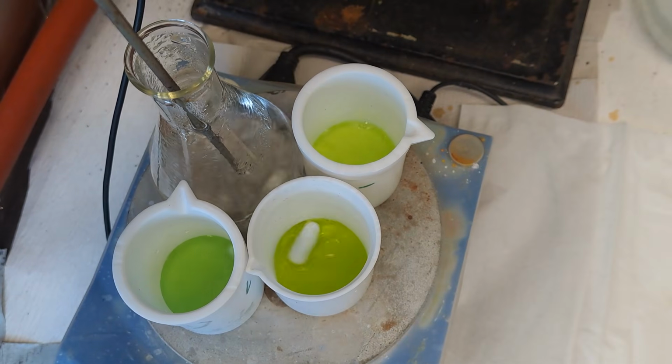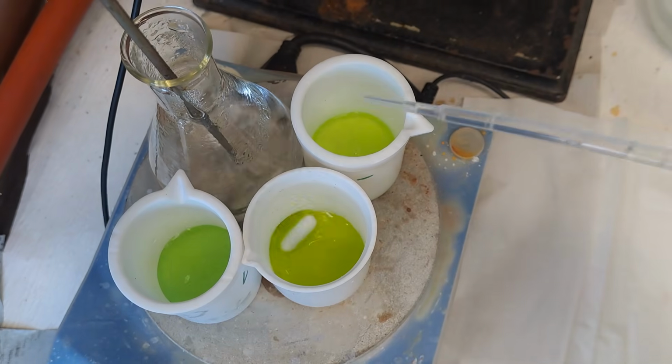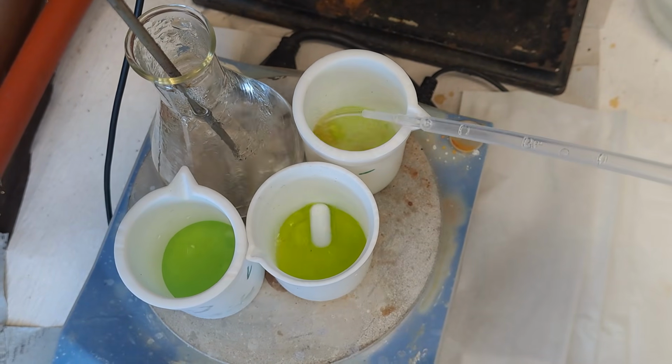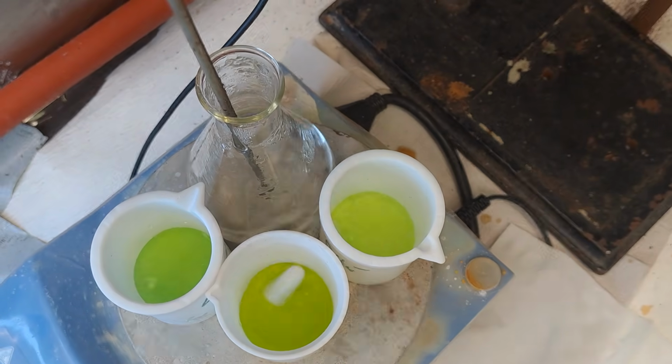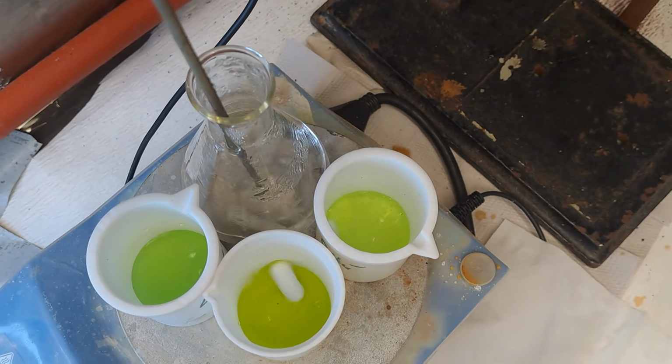Today we are going to test the synthesis of uranium tetrafluoride using various reducing agents. I've specifically chosen 3 particular reducing agents. There are many more suitable reducing agents for the uranium tetrafluoride synthesis though. But first, why use reducing agents and why should we make uranium tetrafluoride in the first place?